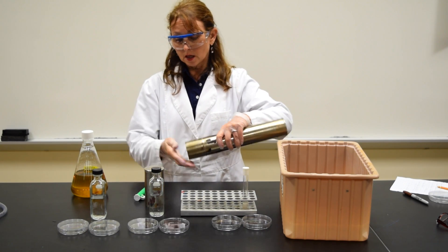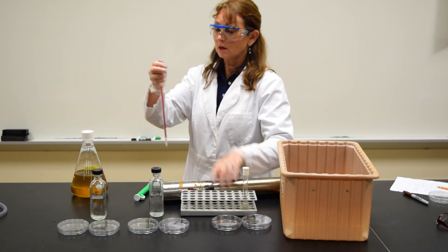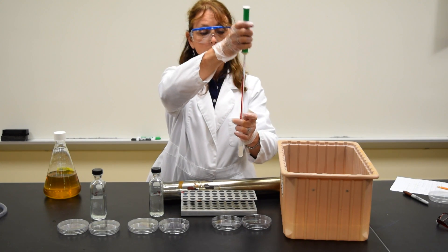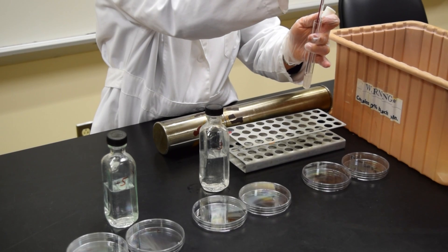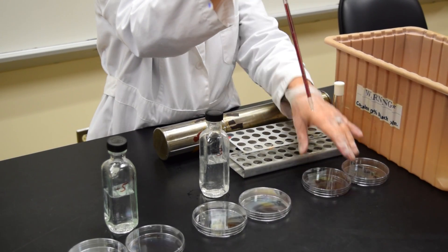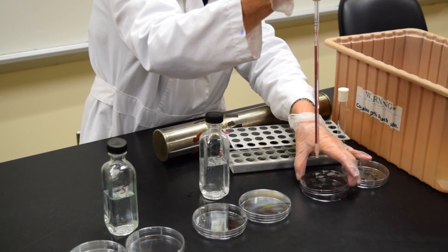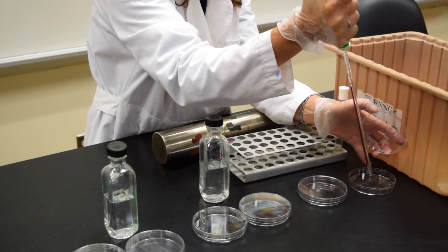I'm going to open the can of pipettes and remove one pipette, making sure that I don't rest it on the bench or touch it. I'm going to go into the tube, draw to the 1.1 line, and dispense 0.1 ml in the minus 2 plate. With the remaining 1 ml, I'm going to expel it in the 10 to the minus 1 plate.